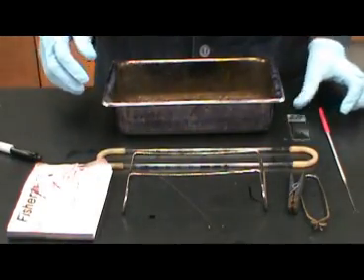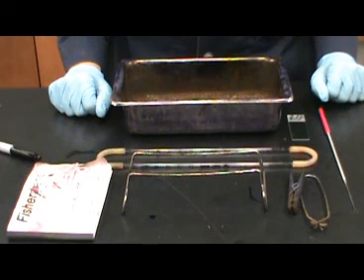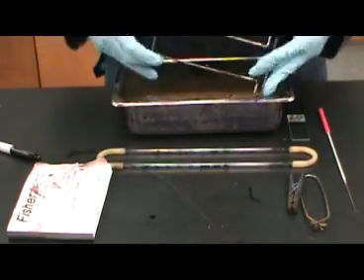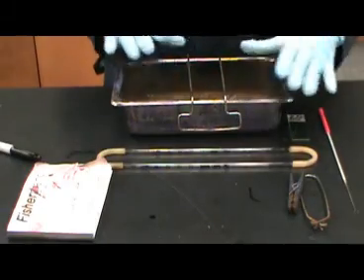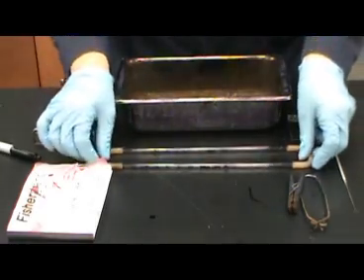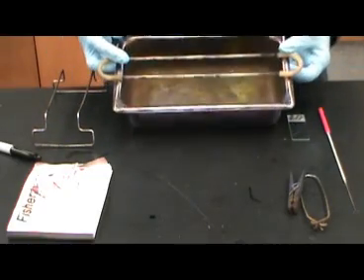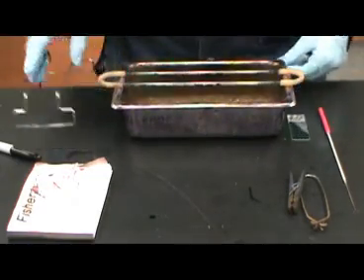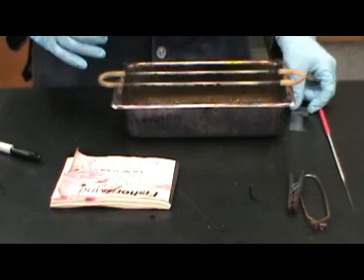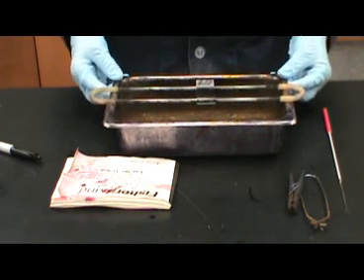In our laboratory, we use simple staining trays. A small metal pan and a staining rack is placed on top. You may have a rack made out of glass tubes with rubber tubing, or you may have a metal rack that fits on the top of the metal pan. Either method is appropriate. Place the air-dried and heat-fixed slide on top of the staining rack. You are now ready to apply your stain.